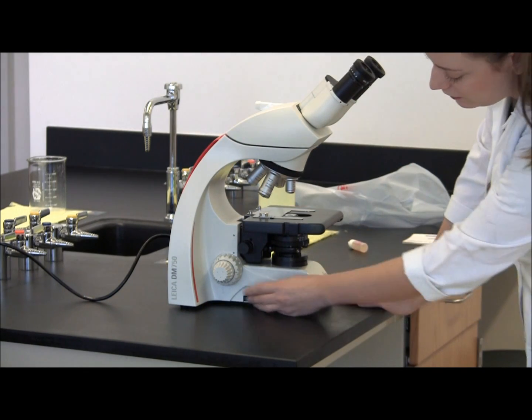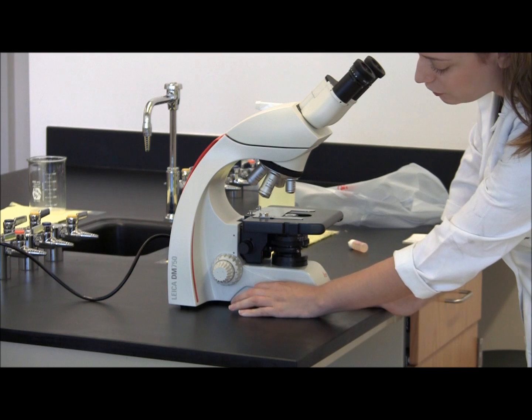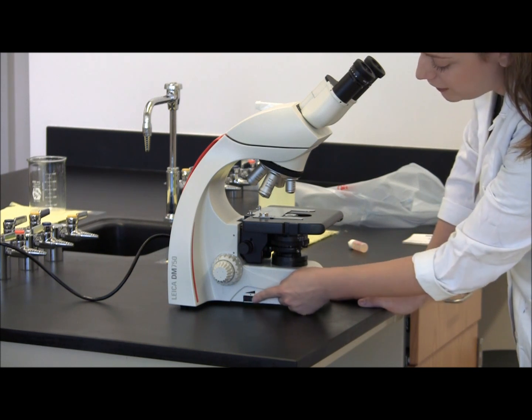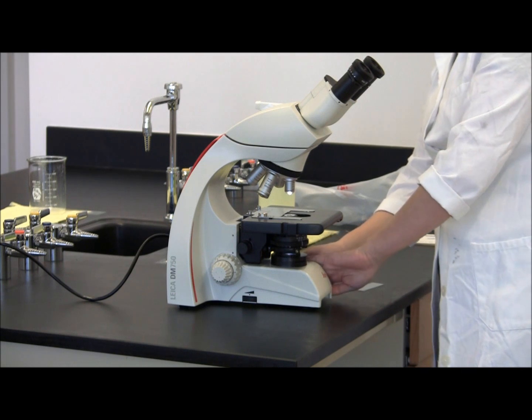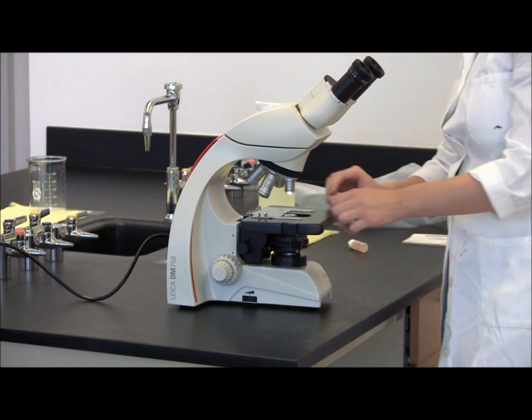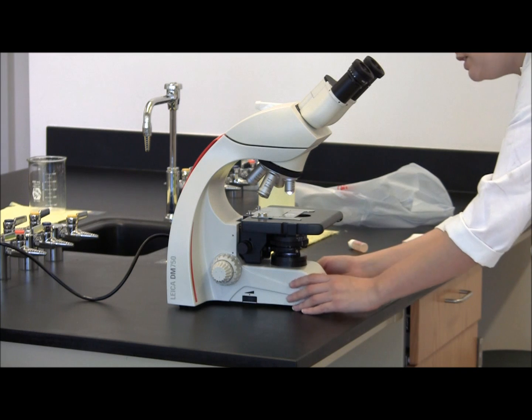Finally, you can adjust the amount of light that passes through the microscope using this adjustment wheel here. To turn the microscope on, the power switch is located on the opposite side, and it's a green switch that should be fairly easy to see.